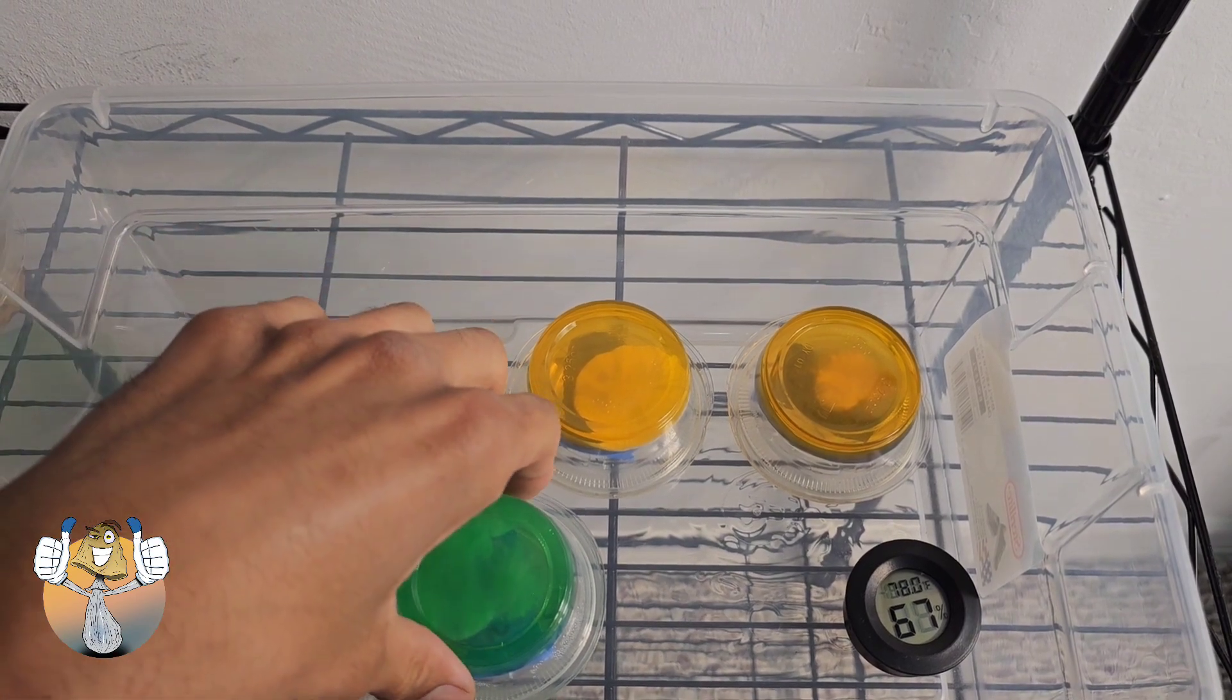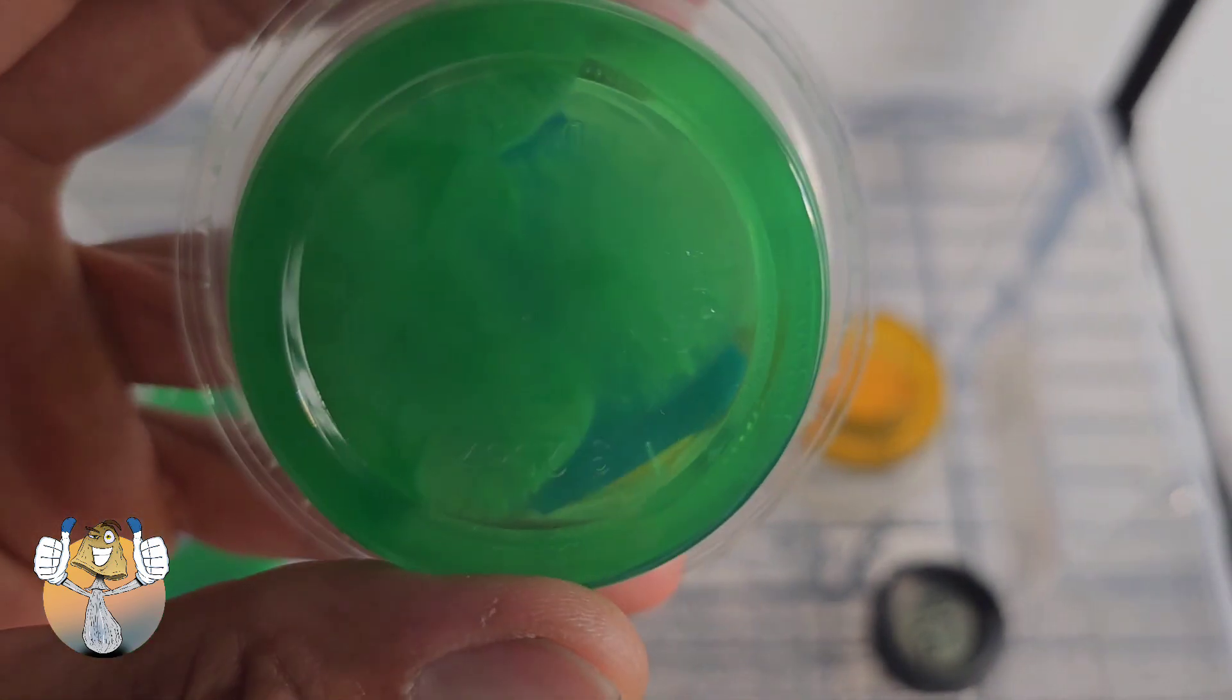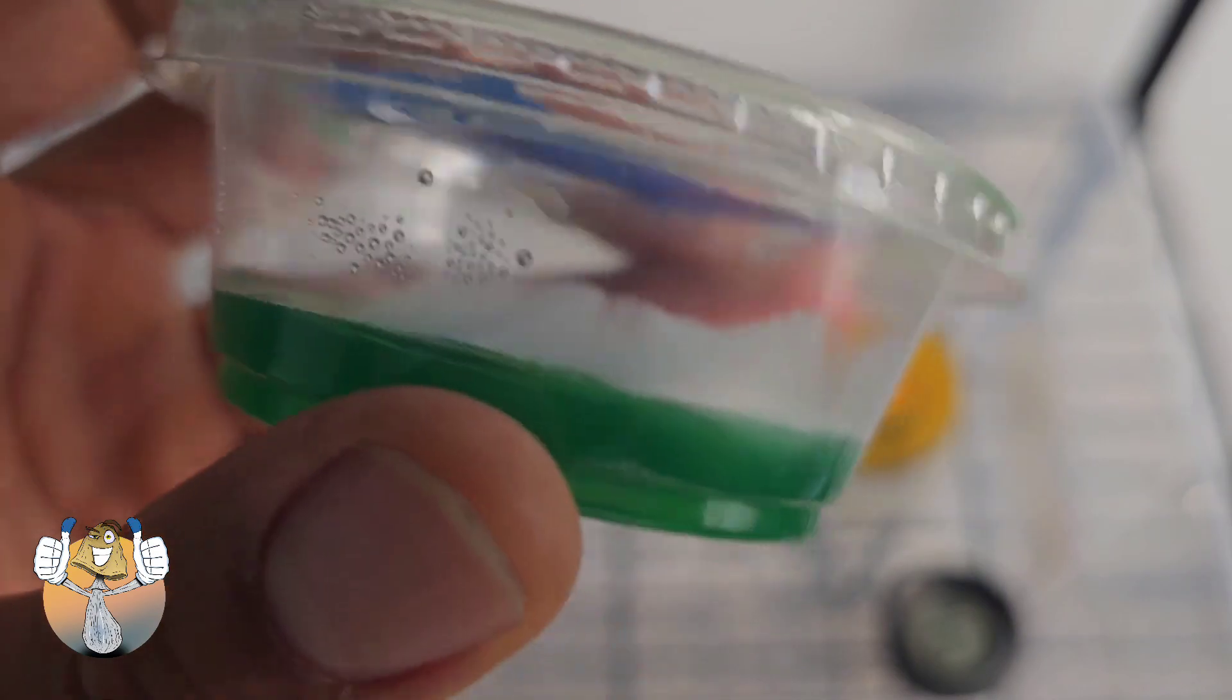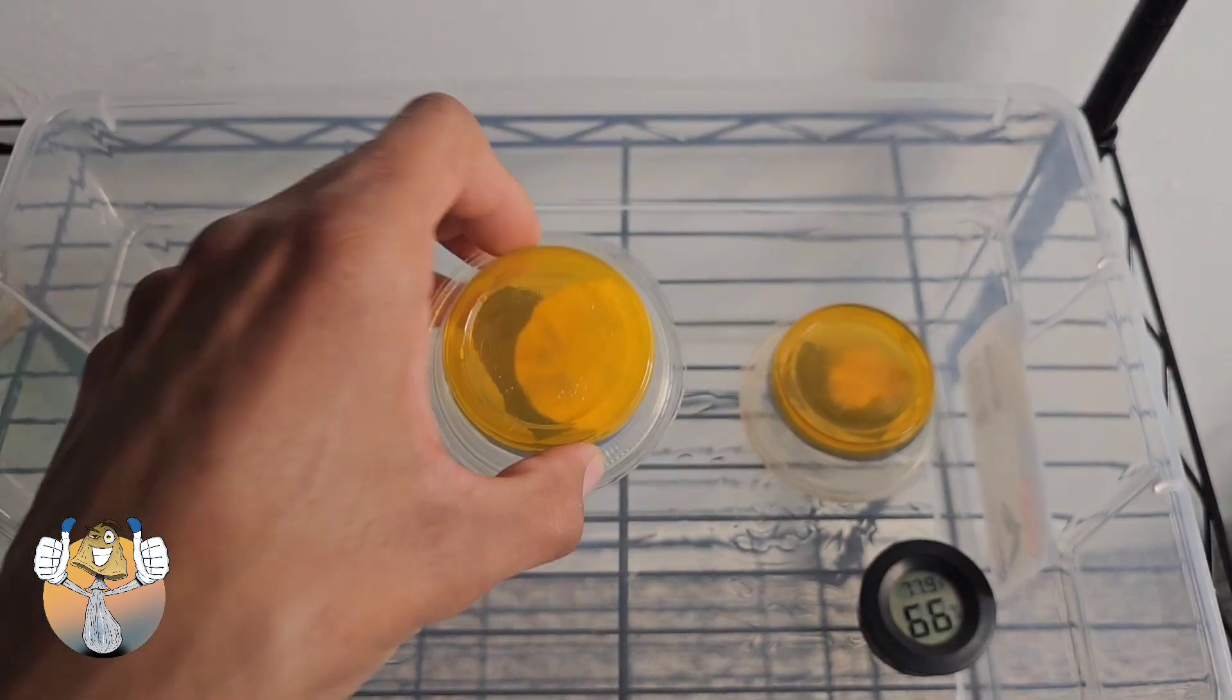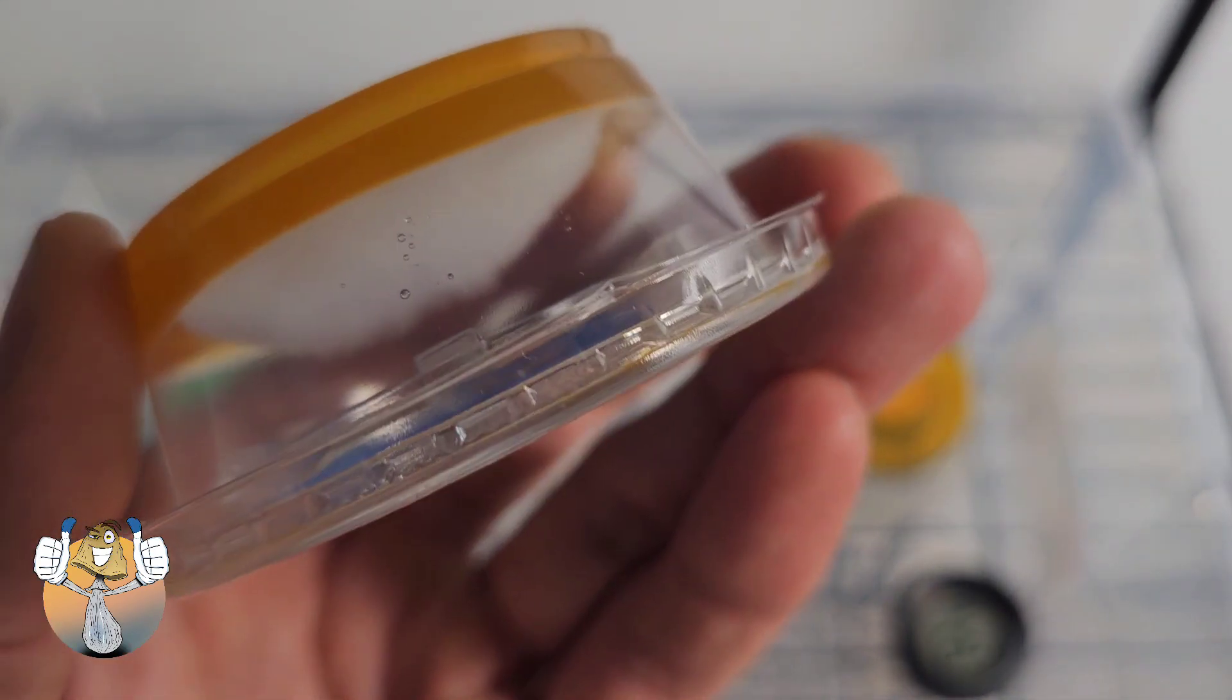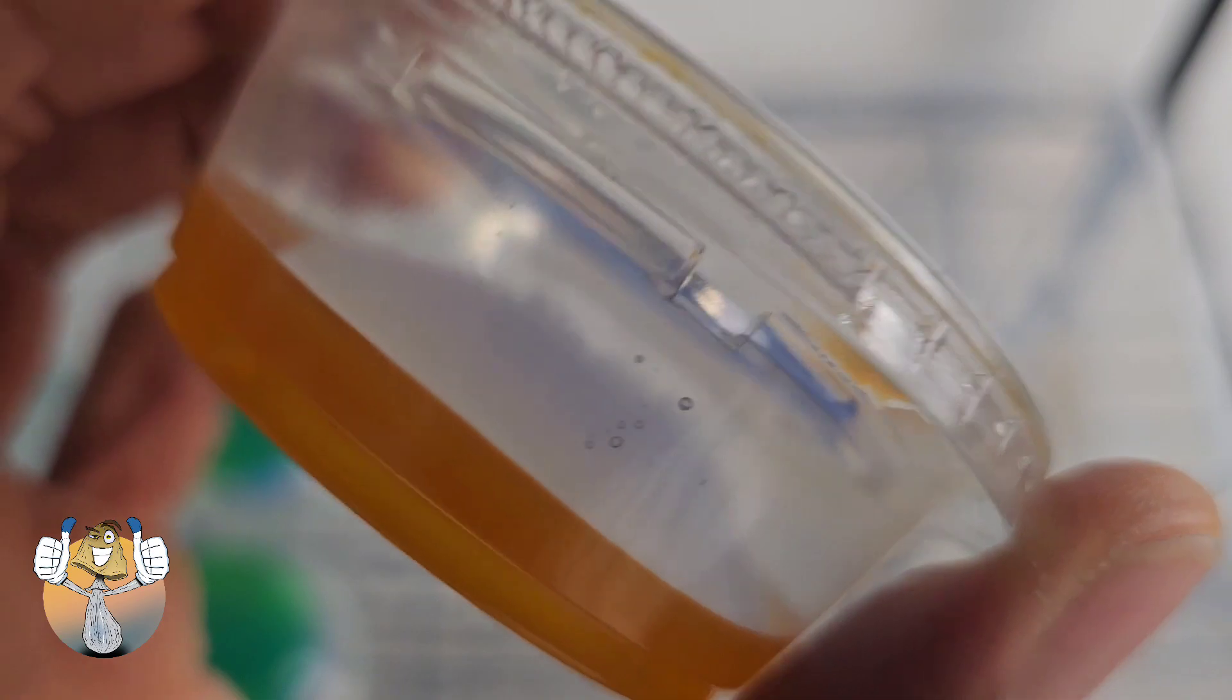All right. As you can see, my temperature right down there is what, 78 degrees, 77. That night, still climbing up the wall. We have some on the flat surface, very nice. I'm very happy with these results, man. This experience is beautiful. It's like therapy, so peaceful, so interesting. You're always learning something new. Look at that, so beautiful. Oh man, it's a little mountain now. Very nice. Mount Mycelium.